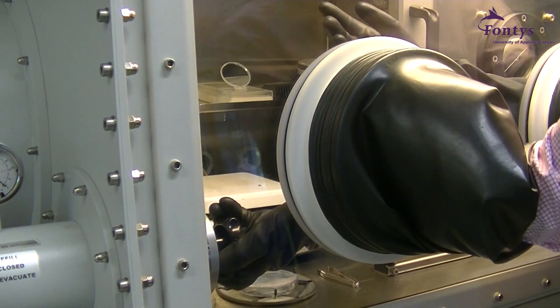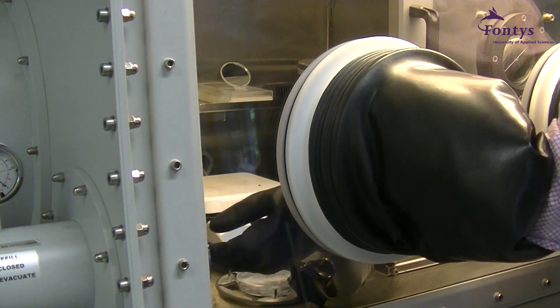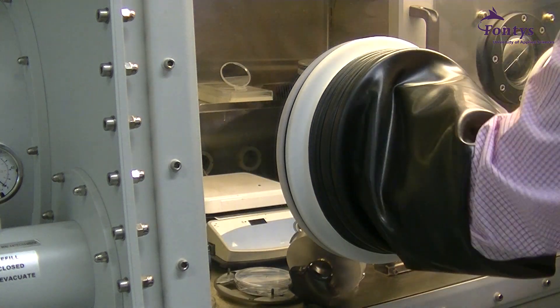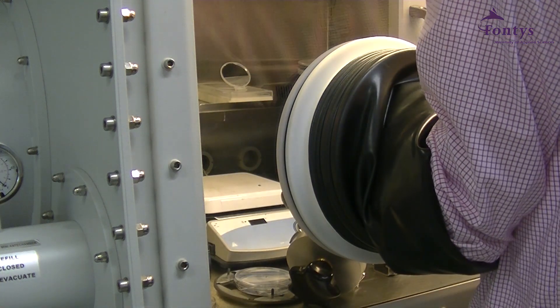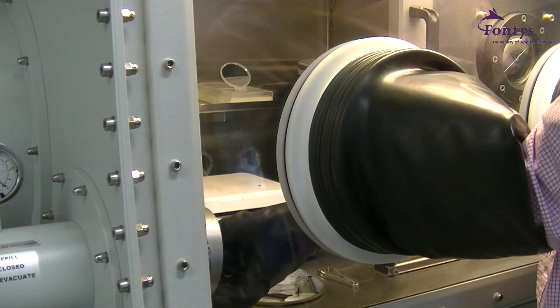Inside the glove box there is a vacuum chamber in which deposition takes place. During deposition, a vacuum is created which lowers the boiling point of aluminum from 2500 to 800 degrees Celsius. By controlling the temperature, it is possible to deposit a desired thickness of aluminum per second.